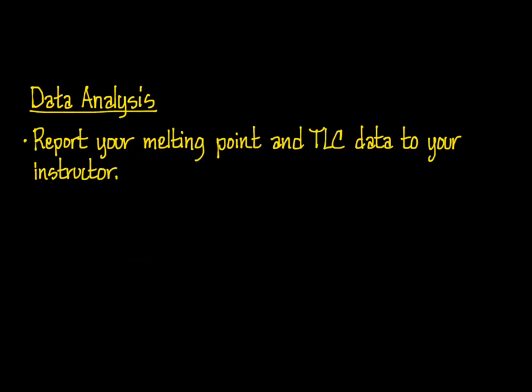Finally, a bit about data analysis. Since you need data from your classmates who started with different compounds than you did, and they in turn need your data, before you leave the lab, report your melting point and TLC data to your instructor. Your instructor will compile the data and distribute it to everyone in the class.